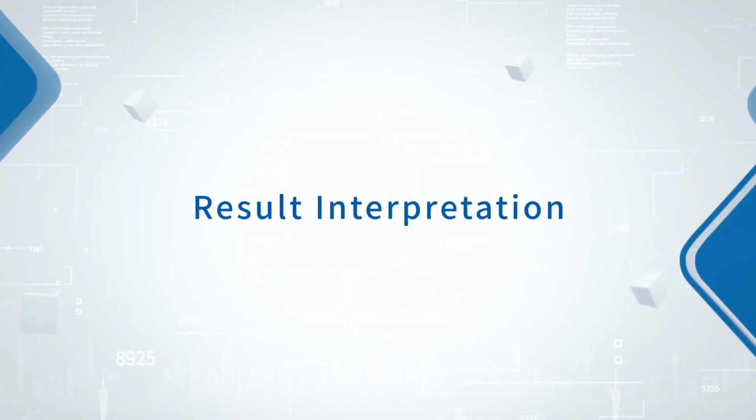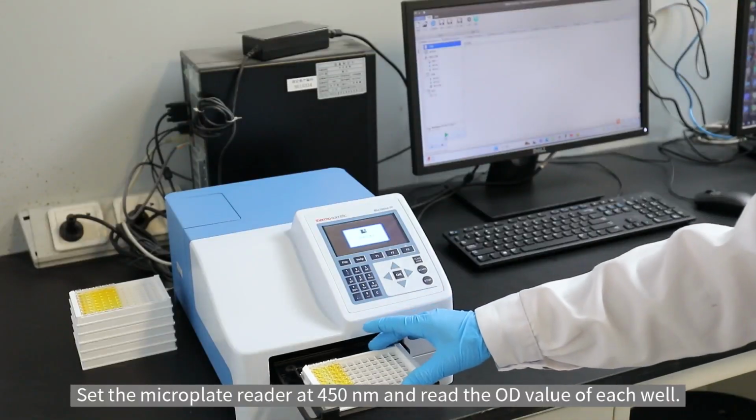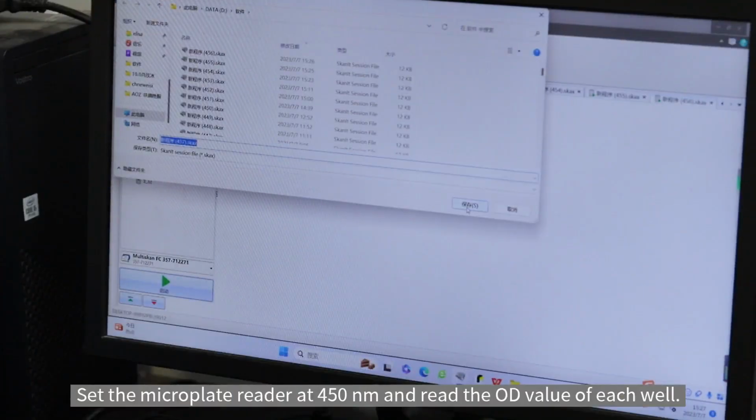Result interpretation. Set the microplate reader at 450 nanometers and read the OD value of each well.